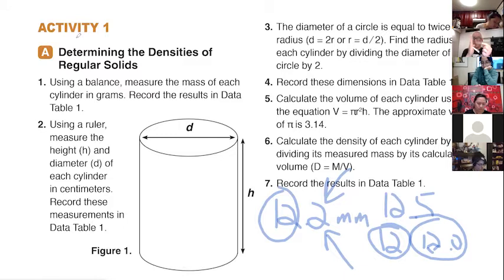If it was right on the line, it would be 0.0, but it isn't. So now it's up to you to figure out, well, how much do I think it's past the line? If I think it's just past, it could be like 0.1 or 0.2 or 0.3 maybe, but that's your call. And that is also a significant digit. And that'll also be true when we're measuring the volumes of our solutions tonight. You should get 3 significant digits in that measurement as well.